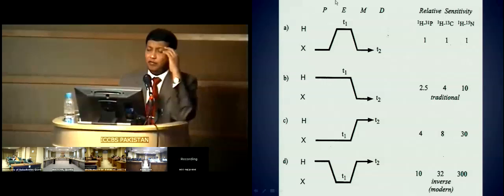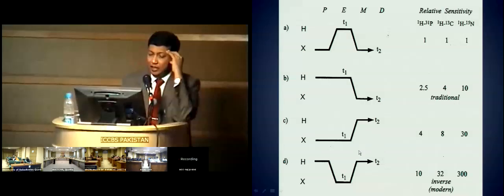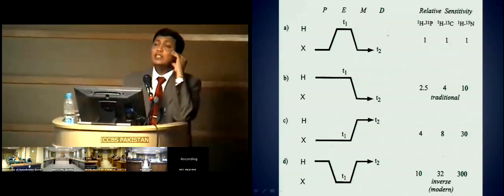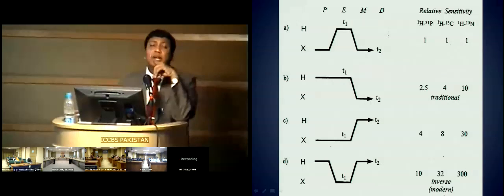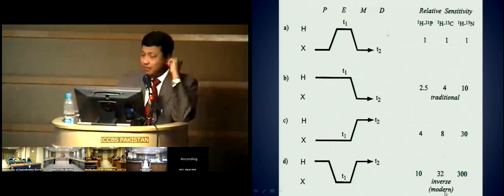So this is my favorite slide. I like it very much. And this primarily means that you are actually detecting the proton. You're detecting the proton, and it is 32 times more sensitive as compared to carbon. Please remember carbon, right? Carbon.